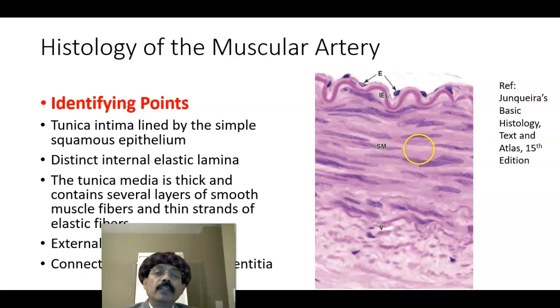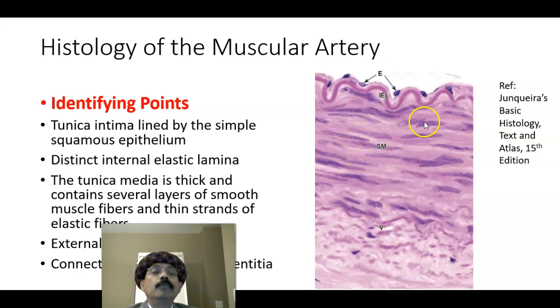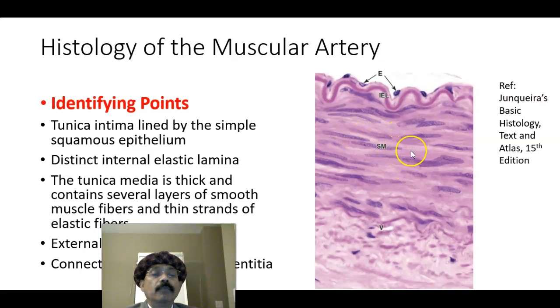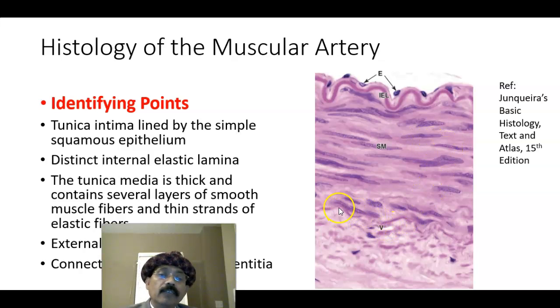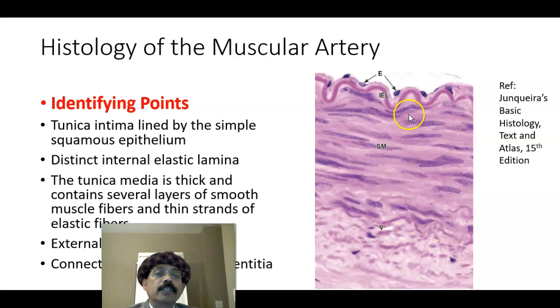There may be up to 40 layers of smooth muscle in the tunica media. Between the smooth muscles there are elastic fibers, and the smooth muscles communicate with each other by means of gap junctions. The external elastic lamina is indistinct in this slide, and both the internal and external elastic laminae are fenestrated.